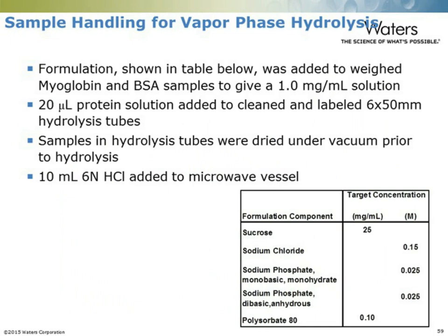We have investigated the effect of the sample formulation. In most cases, we would like to be able to measure the protein concentration of our biopharmaceutical as we formulate it, so that there's buffer, so that there's stabilizer, so there's sugar being present.